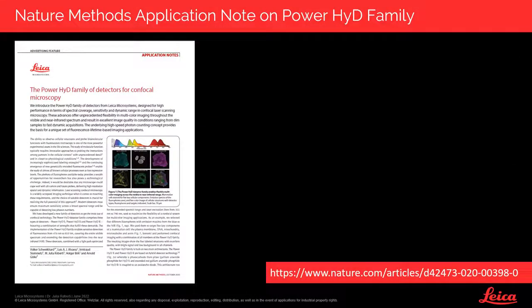We have published a Nature Methods application note with the principles and applications around the Power HyD family. This application note is open access and you can find it very easily, and we can share the link with you to go into the details and learn more.